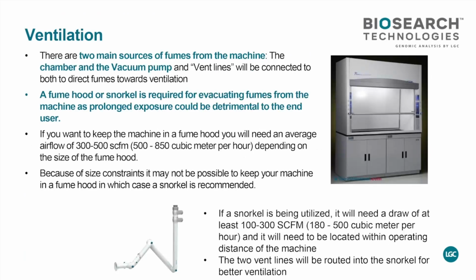As I mentioned, for ventilation, this is the chem hood, and this is the snorkel. It's kind of an arm that comes in from the ventilation. You can bend it. It has a little dish on it, and it pulls out the smell that comes out from the vent of the instrument and also helps you when you put the reagent on.